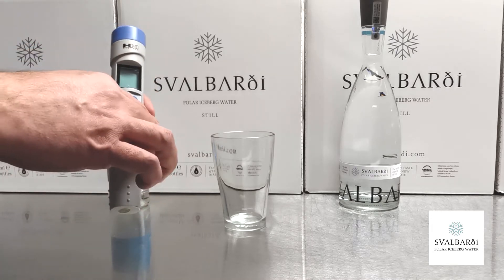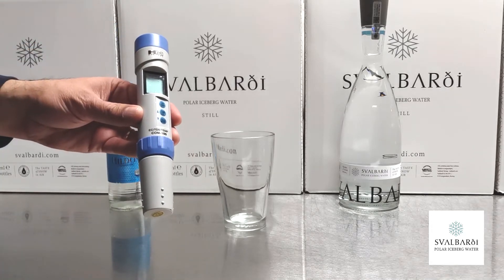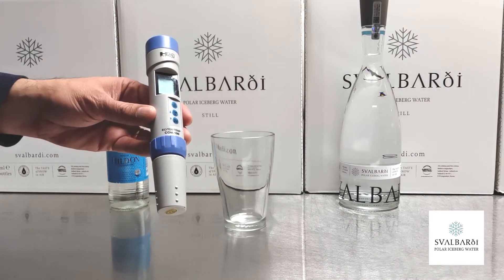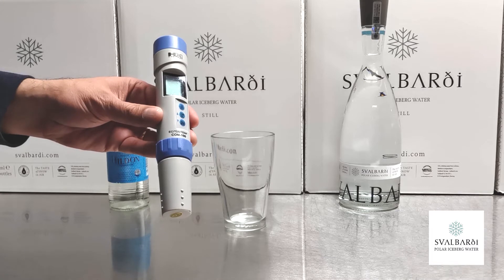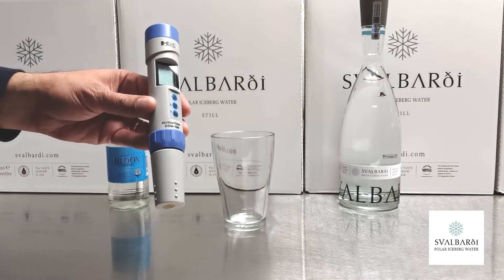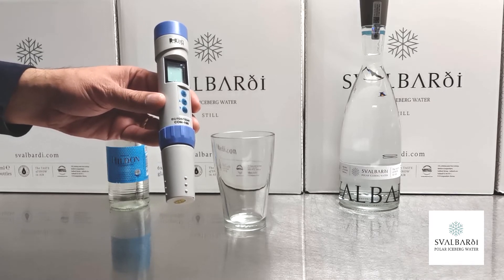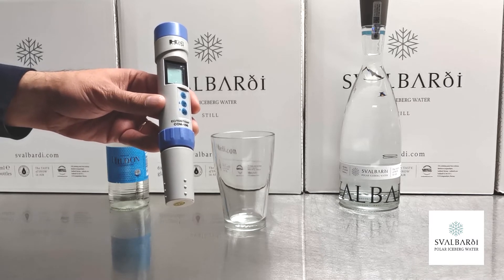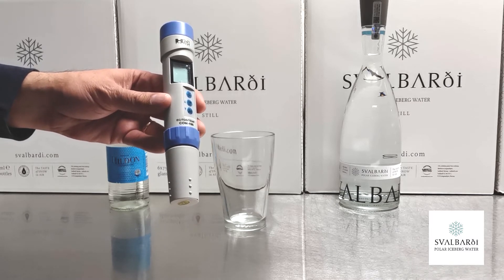That is by using a TDS meter. What this does is it measures the electroconductivity of the water. Water itself does not conduct electricity, but when there are minerals in it, electricity will conduct through it. So if we measure how much electricity is moving through the water, then we can tell the TDS level.